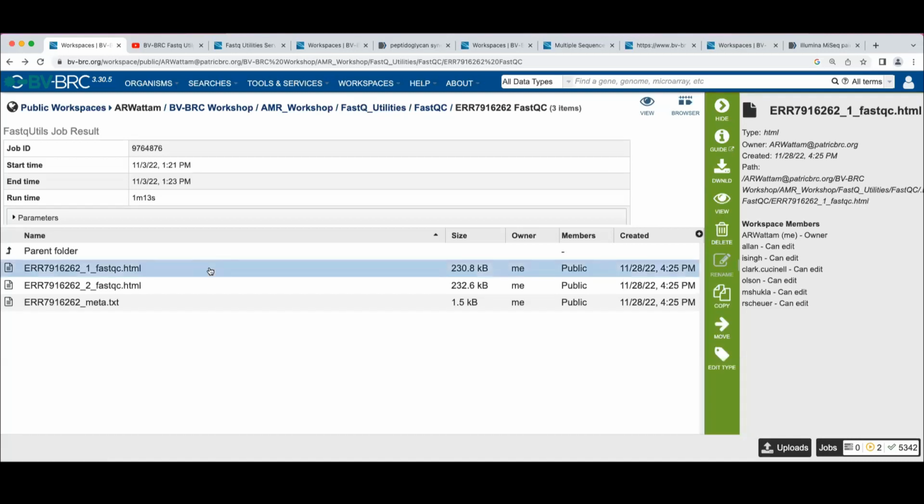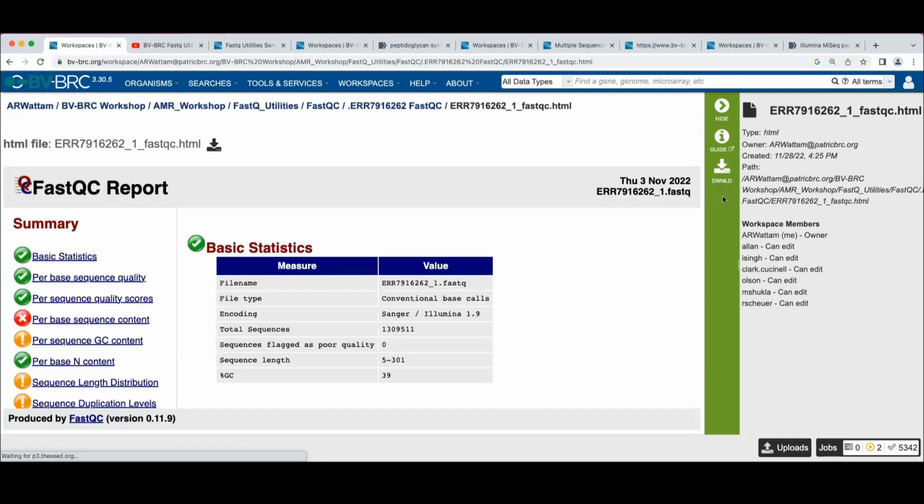So let's just look at one of these. I click on that, and the green action bar, that should be a new Marvel superhero instead of Green Lantern. Oh, is that the DC universe? I may have mixed things up. Whoops. Okay, then I click view.